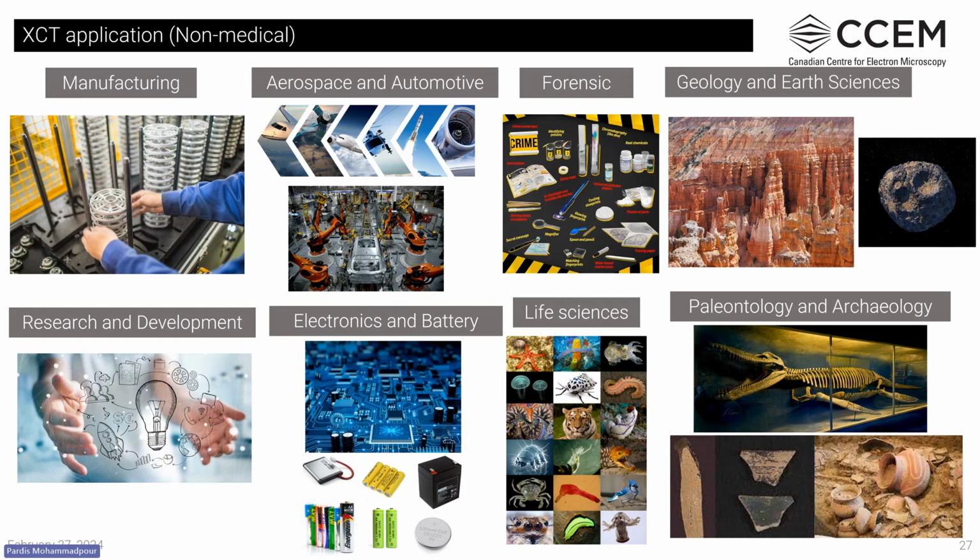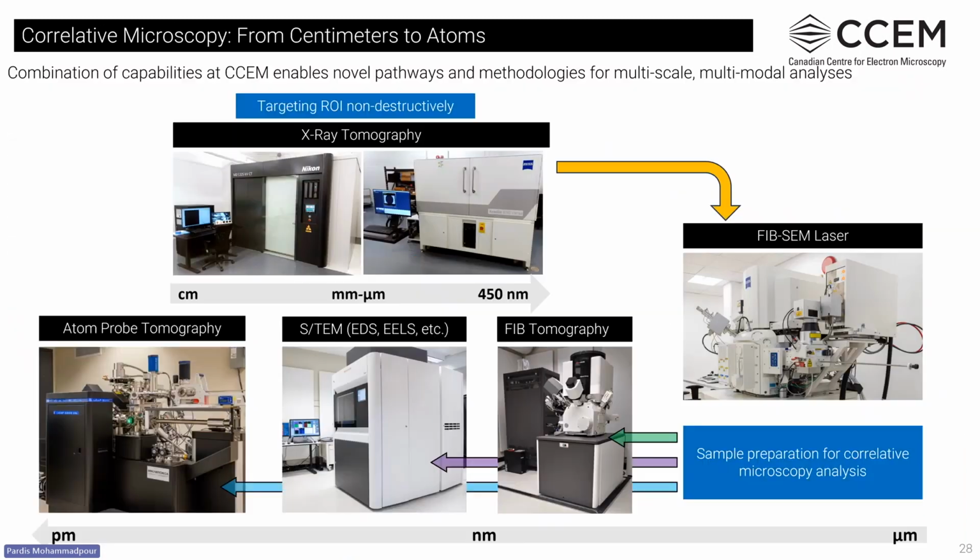And also in paleontology and archaeology researches, we can examine fossils without damaging them and study the internal composition of artifacts, which provides insight into their construction and the historical content.